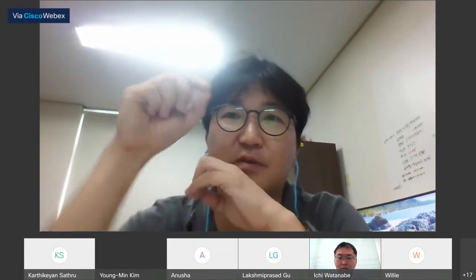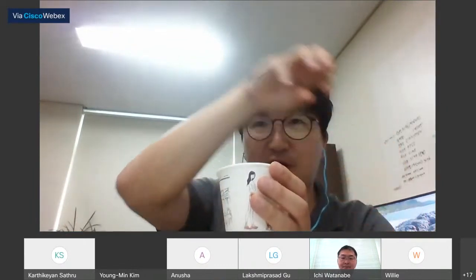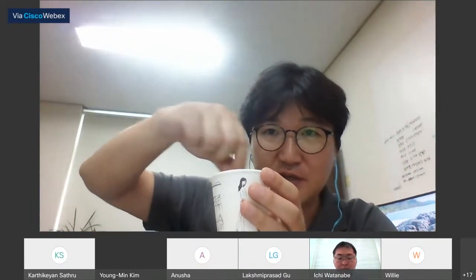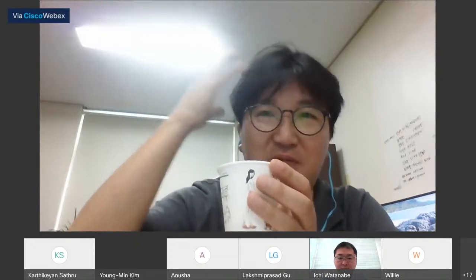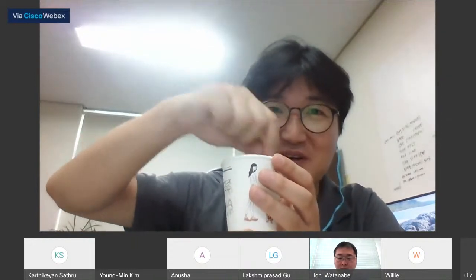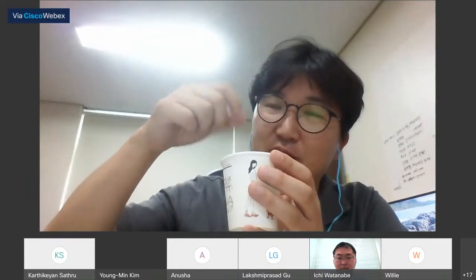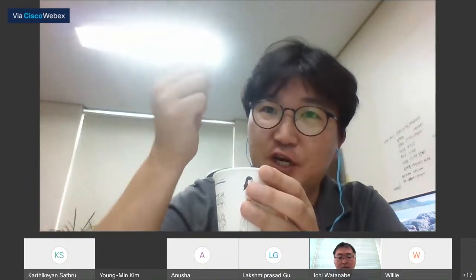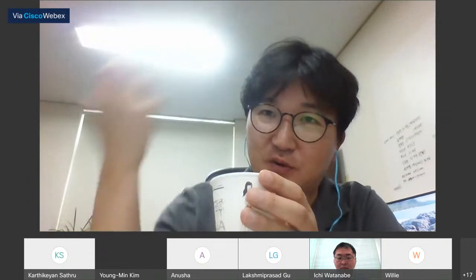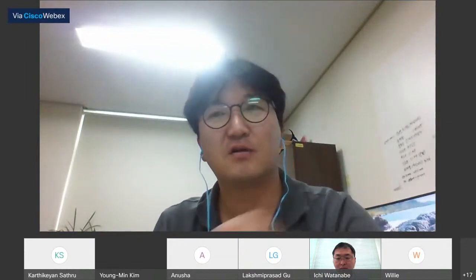However, the important step is the mixing technique. You put the biomass first into the sample cup and the plastic additionally, and the mixing is done by your student or by yourself. In my case, I have a problem, but my student can handle it very well. Afterwards, you use metal sticks and check whether some of the particles were taken out from the sample cup by your mixing step, so it can influence your analytical result.